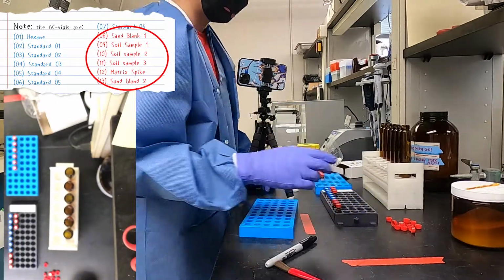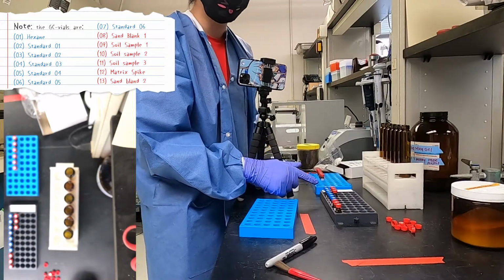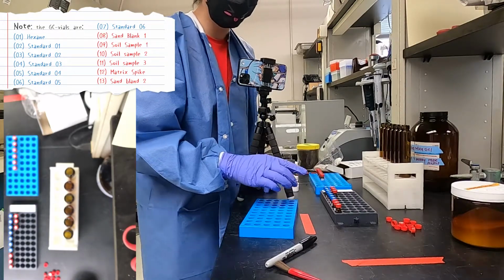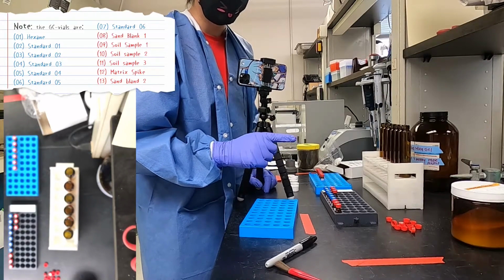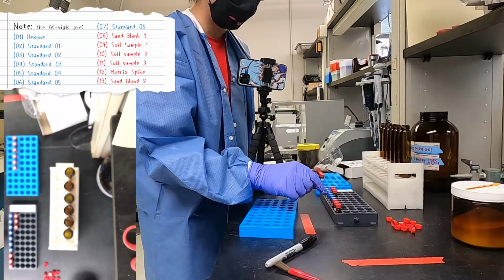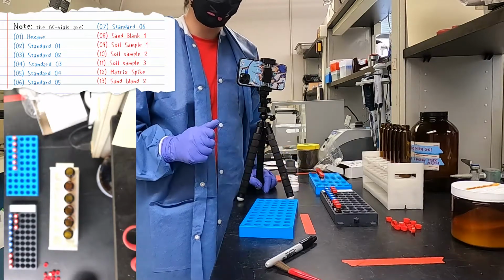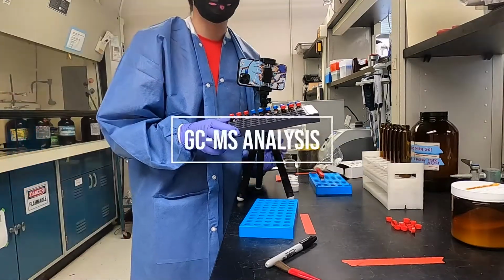And so these are our GC vials. The hexane is for the instrumental blank. And these standards are for the calibration of the instrument. We have 2 sand blanks for the method, we have triplicates of our sample, and we also have 1 matrix spike. And then we are going to take this to the GCMS.